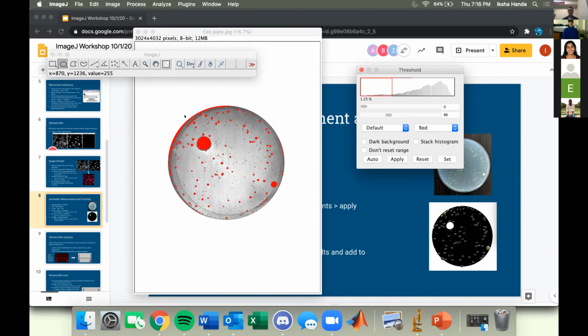So if you want, you can go back again, and because it's easier to see what you really want to focus on, you can recrop. I'll just recrop a tiny bit, just until you're satisfied that you're getting enough of what you want from the image.